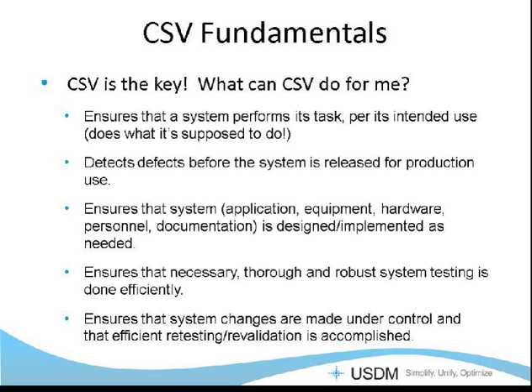We make sure that the application, and when we talk about a system, there's a little bit of a breakdown here. We have the application, which is the software that you're using, and the equipment that's attached to or controlled by that software, so the HPLC or the LCMS or the flow cytometer. Then the hardware that system resides on, whether that's a standalone workstation, a laptop, or your internal network. And the documentation: the SOPs, the training documentation. What documentation do you need to run this system in a compliant manner?